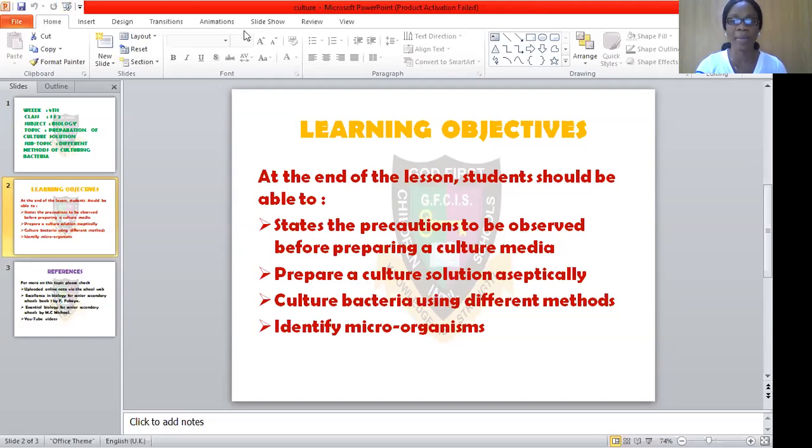Like I said earlier on, today we are going to be seeing two videos. The first one I'm about to share is how to prepare a culture solution or media.